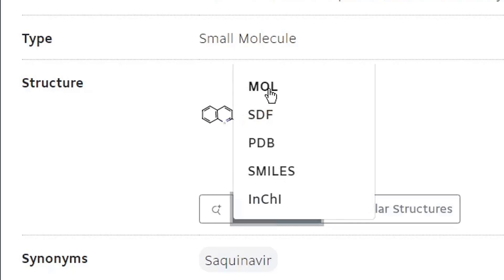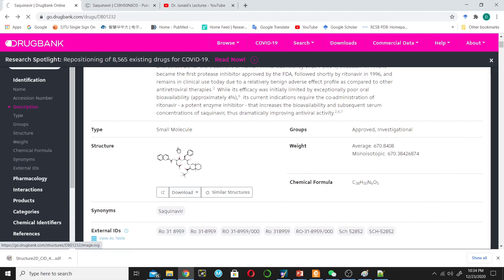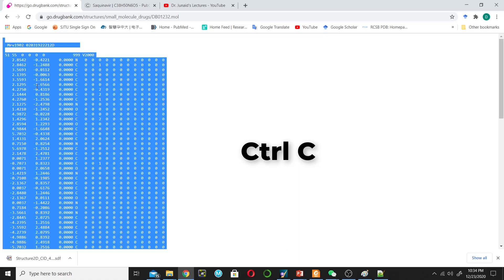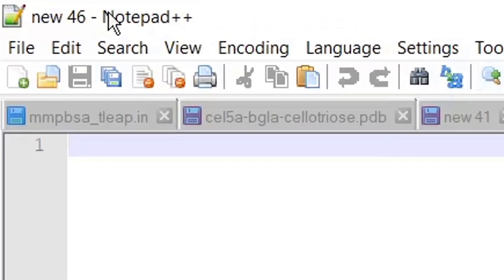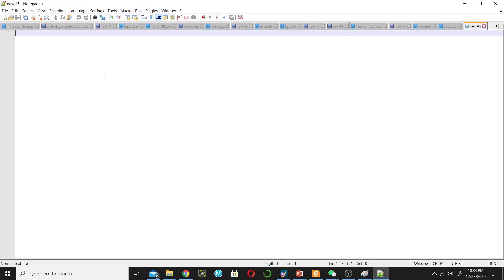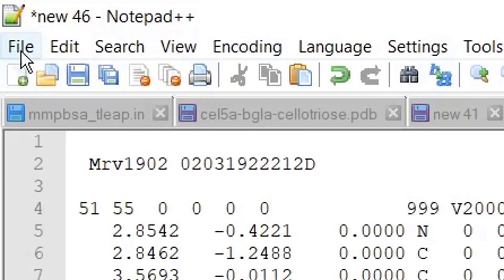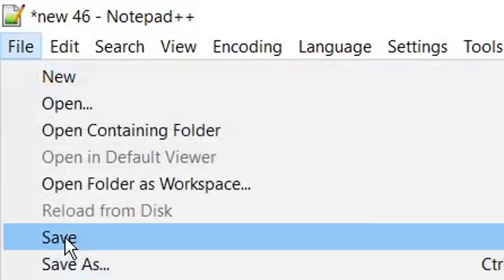There are different format options available. I will choose the MOL format and click on it — it will direct you to a new page. Then select all with Ctrl+A and copy with Ctrl+C. You can use any text editor to save this drug structure. I am using Notepad++, so paste it here and save it by going to the File menu and clicking Save.